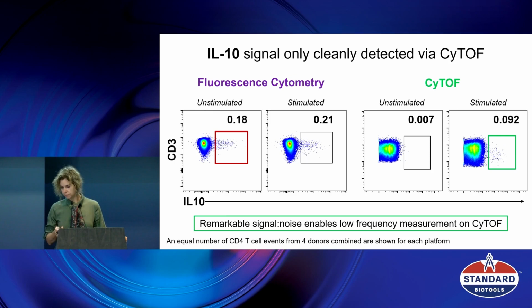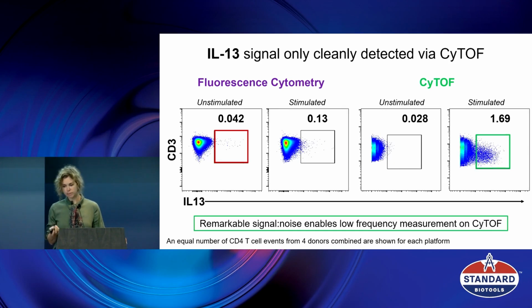And with IL-13, we see a different pattern. That was the most striking result, I think, that we ever had. So again and again, we see it. IL-13 is not detectable by flow cytometry in the hands of around 10 labs that I checked with. You can see 5 OMIPs that have IL-13, and the data look really poor. It's hard. You cannot really see it no matter what color you use.